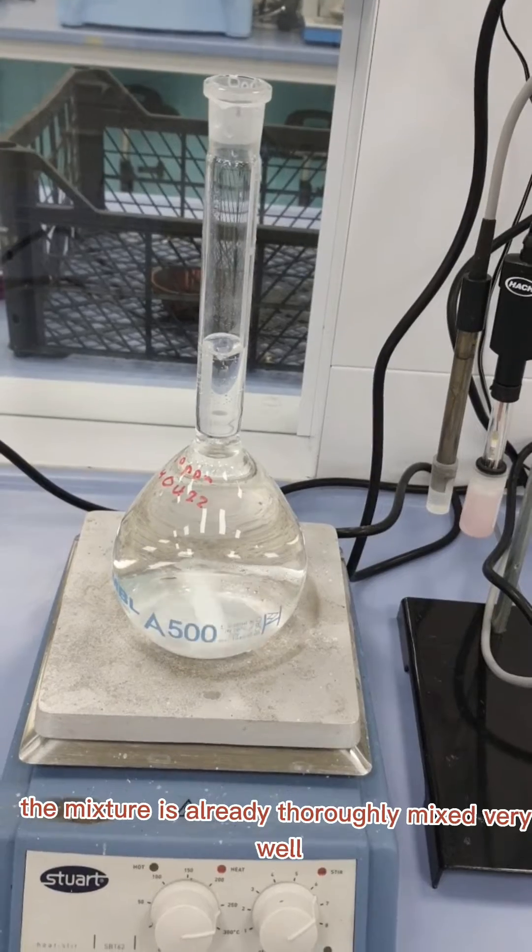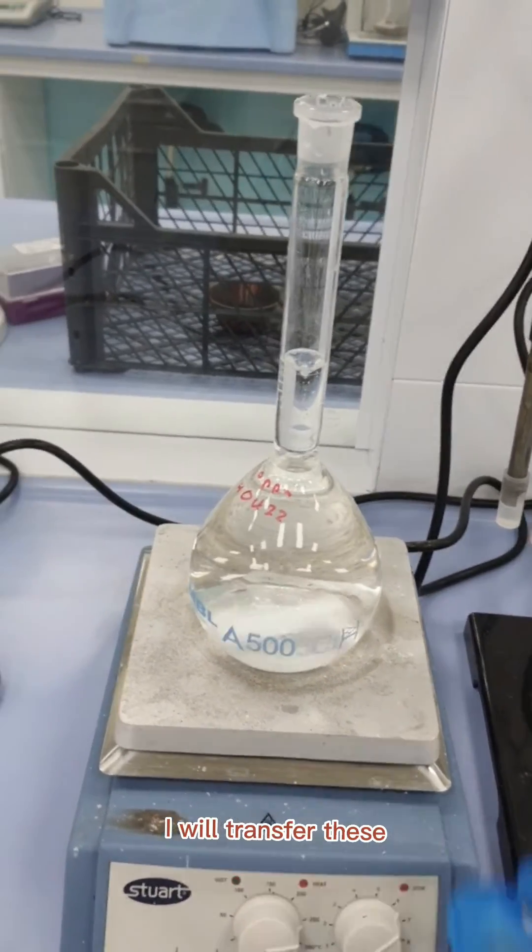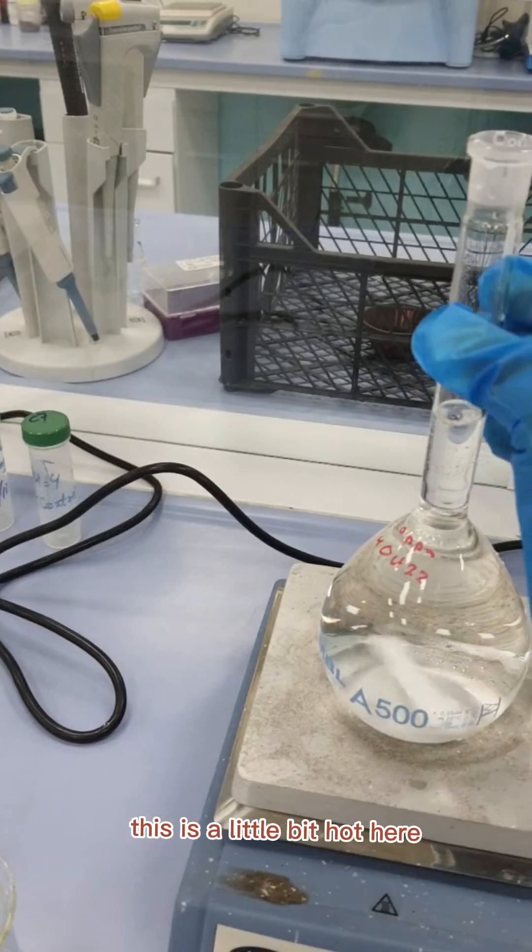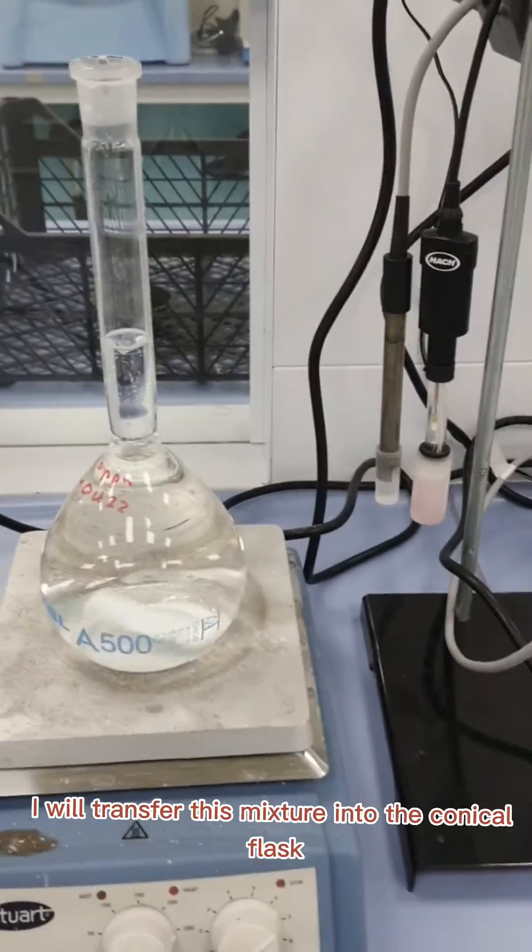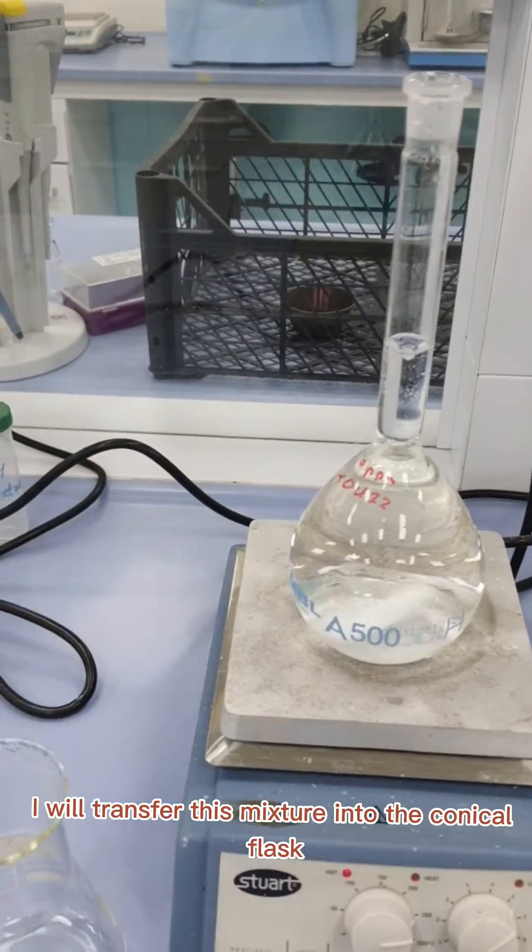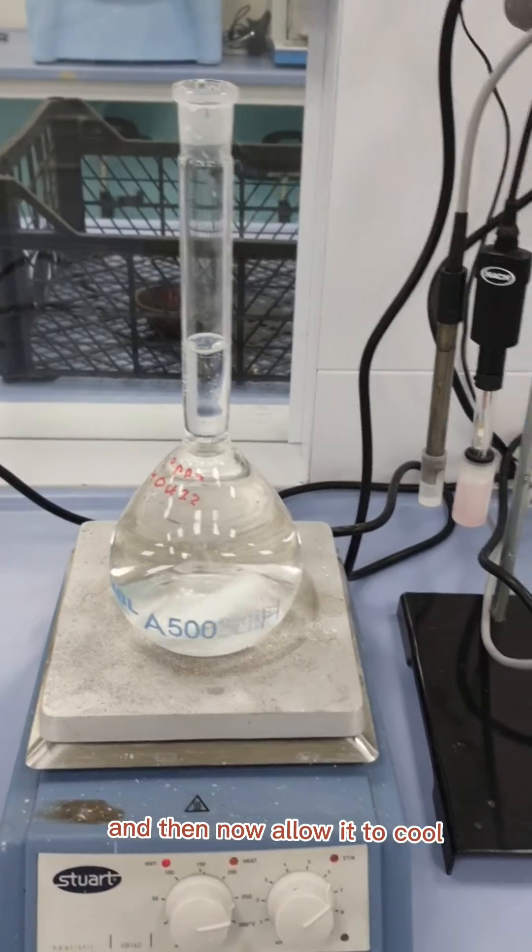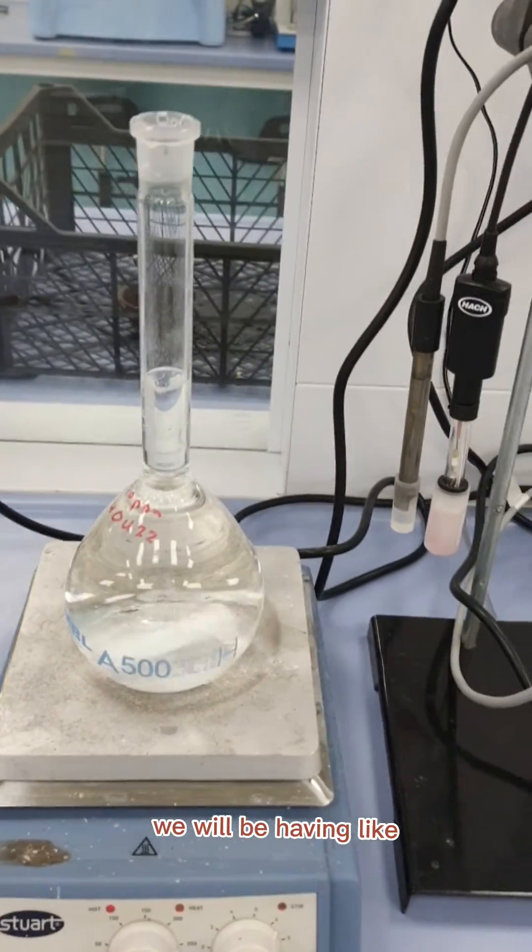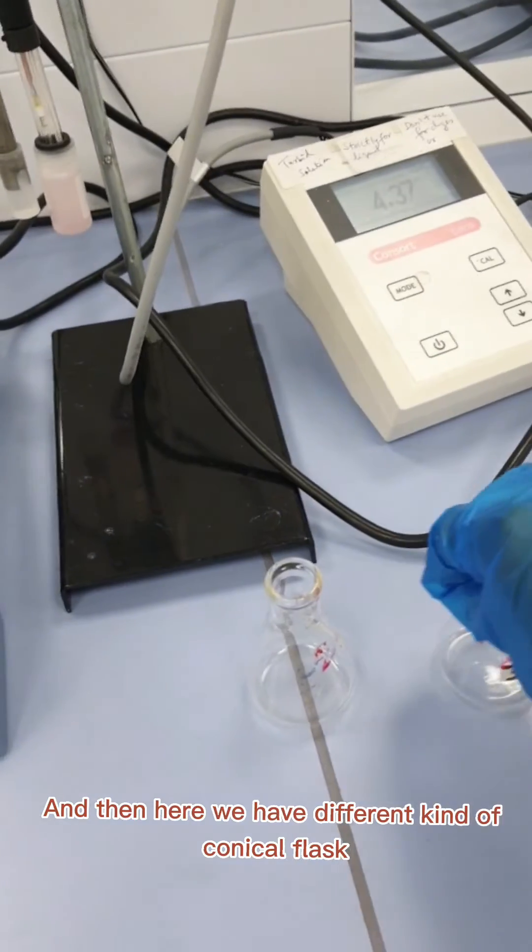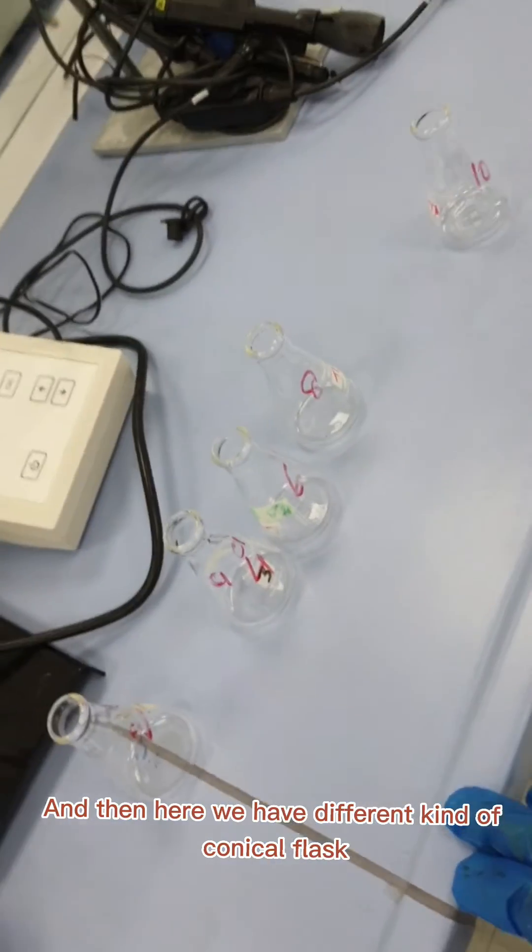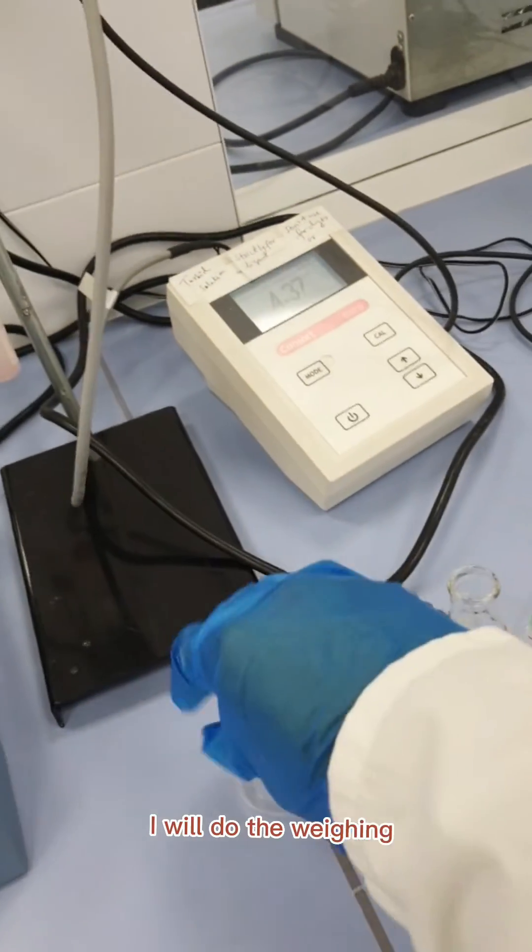The mixture is already thoroughly mixed very well. Now what I will do is transfer this mixture into the conical flask. This is a little bit hot here. Now I will transfer this mixture into the conical flask and then allow it to cool. After cooling we will be maintaining or adjusting the pH in different conical flasks.